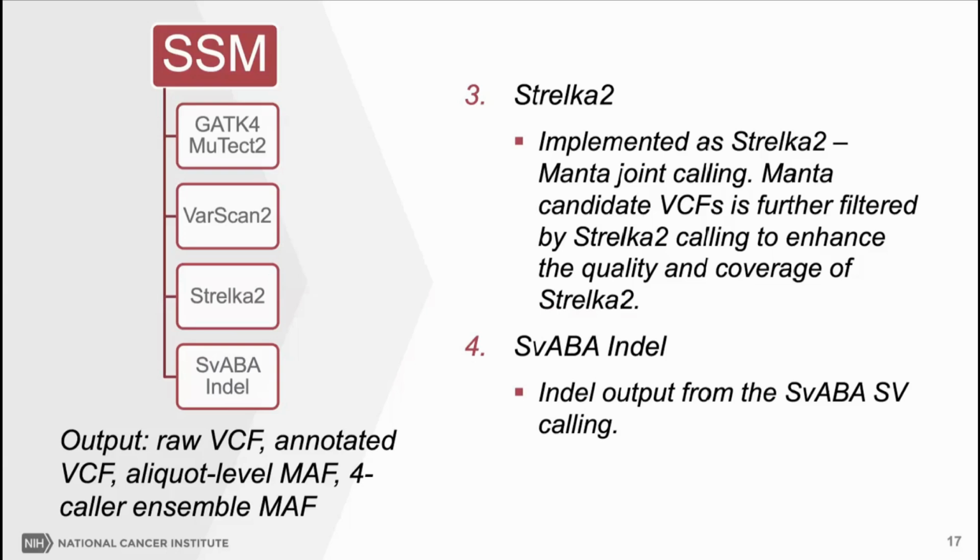And the fourth caller is not a standalone tool, as just mentioned. It's the indel product of the SvABA structure variant calling pipeline. This helps us to enhance the indel detection in the overall simple somatic variant analysis.